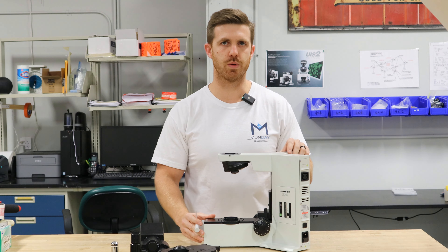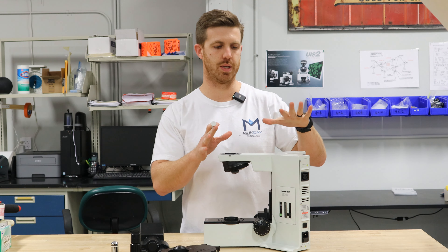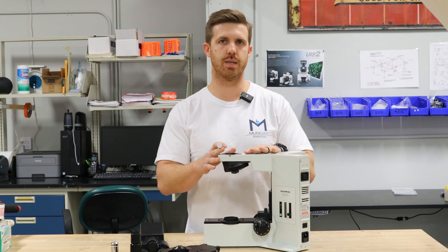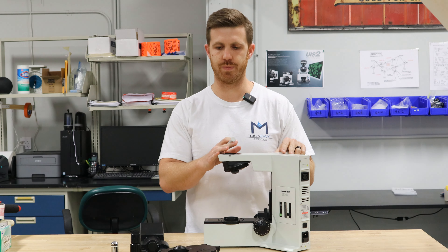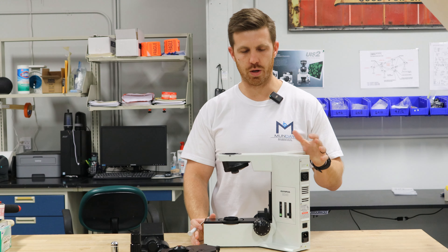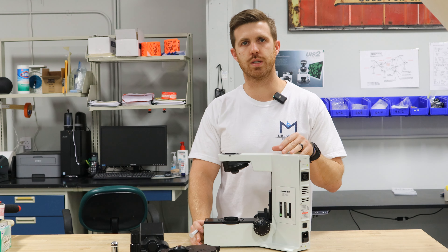So that's the main question we get asked, and that's the main difference between this stand and a BX41 as far as the assembly and disassembly of the system. So we'll put it back together really quick. And if you have any questions, you can drop us an email or send us a message.